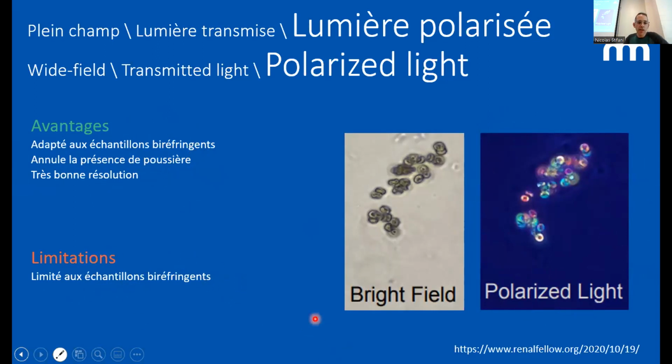So in biology, we have some birefringent samples, such as collagen. There are also some muscle fibers that you can actually visualize with that. It's usually things that have a frequency or very thin stripes that give you this birefringent sample. Or minerals, also stones, are usually used for polarized light microscopy.